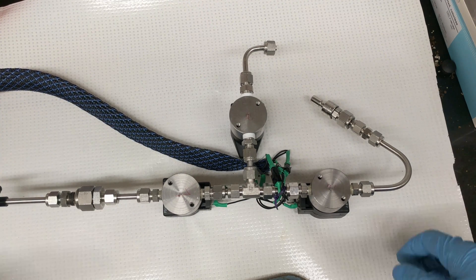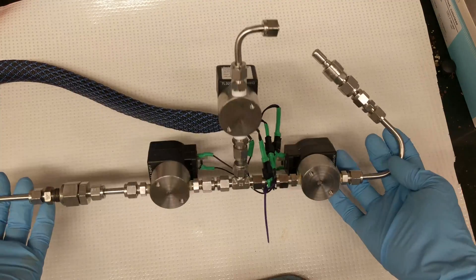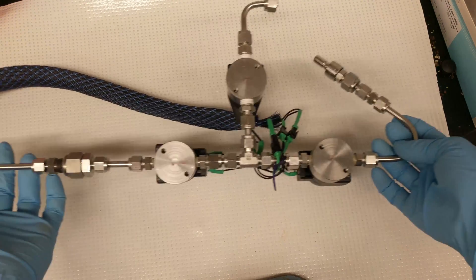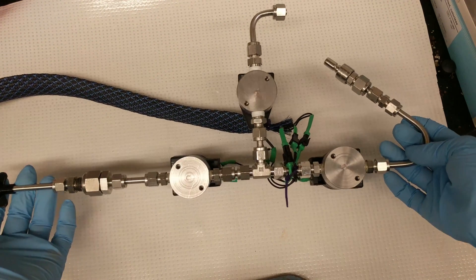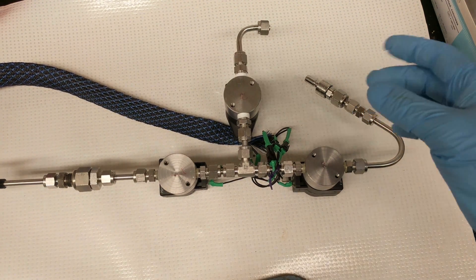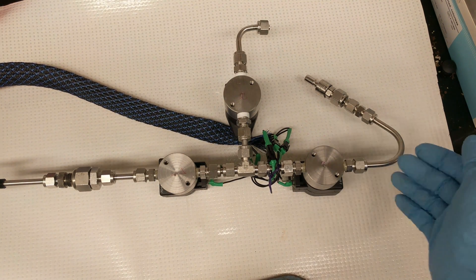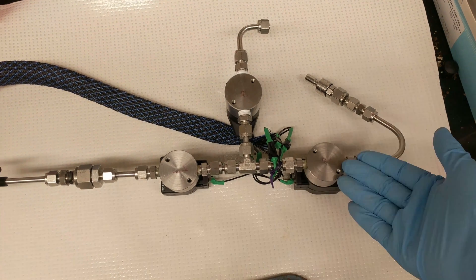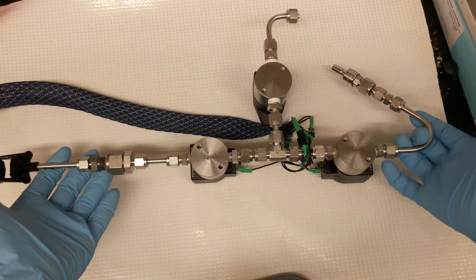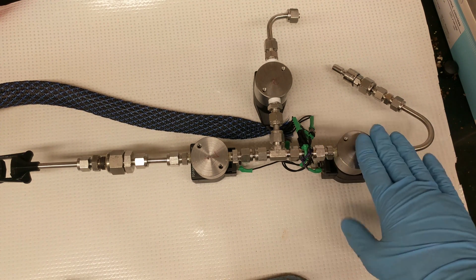Just as a bit of a teaser, I'm hard at work on optimizing the gene gun. Here it is — I would call it almost a final form. It's a lot lighter, cleaner, and smaller than it used to be. I'll have a full write-up or video on it later once I'm happy with it. In terms of transformation rate, I'm chasing the Helios as my benchmark. What I'm finding is there's a lot of variability, even in the Helios shot per shot with transformation efficiency.